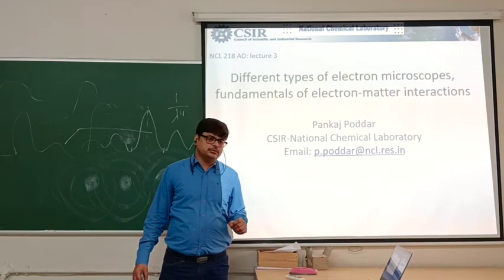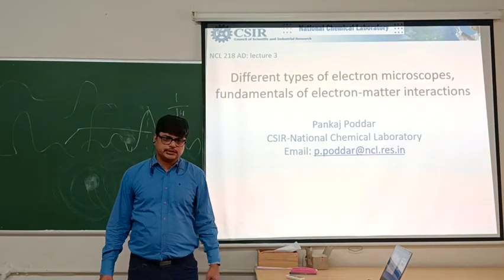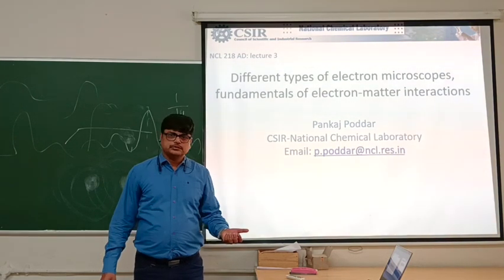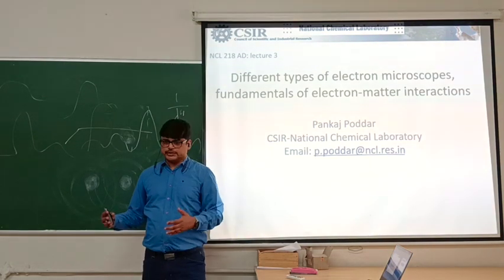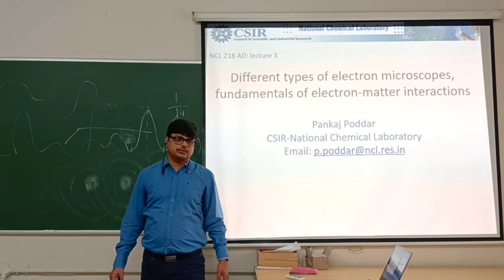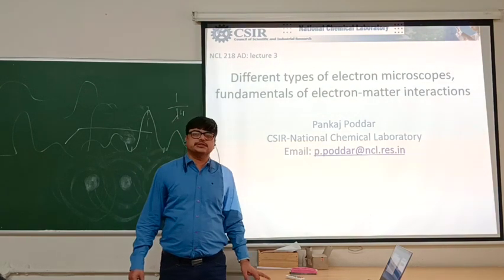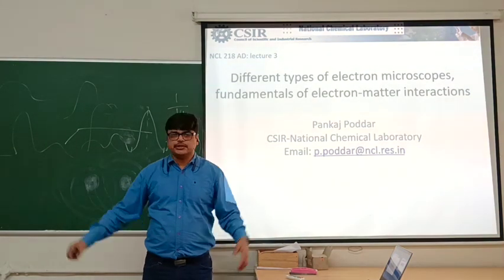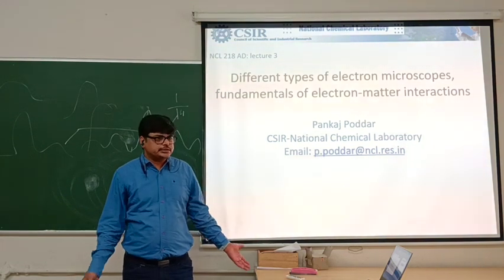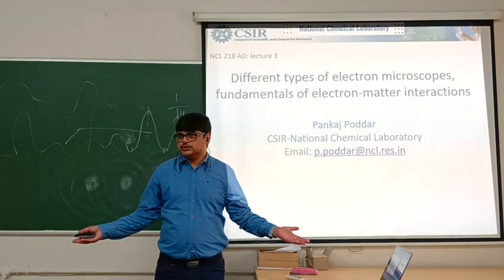And so in electron microscopy there will be applications, and one application at NCL is called HAADF, high angle annular dark field mode. In HAADF mode, these electrons, after scattering from your sample, lose their coherence because of the high angle. Why do they lose coherence? We'll discuss that here. These signals were considered a nuisance, junk signal, with no application. Because, as I mentioned, there is no coherence, you cannot get any crystallographic or structural information, right?